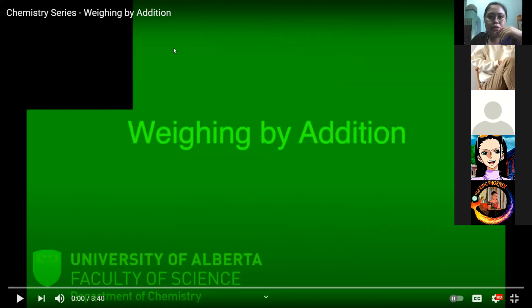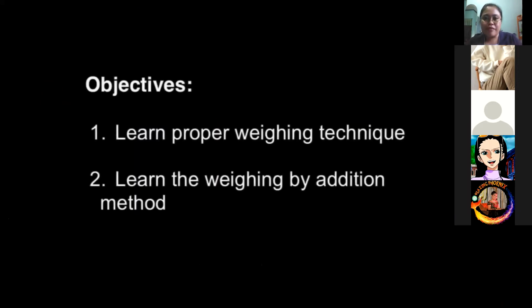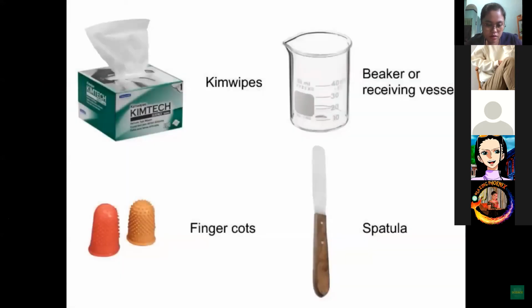Okay, let's watch this video para kabalo mo ug unsa jud ang tama na weighing technique. So the first one is weighing by addition. Weighing by addition. The objectives of this video are to learn proper weighing technique and to learn the weighing by addition method. To weigh by addition, you will require Kim wipes, a clean and dry beaker, finger cots, a spatula, a compound to weigh, and a laboratory notebook.